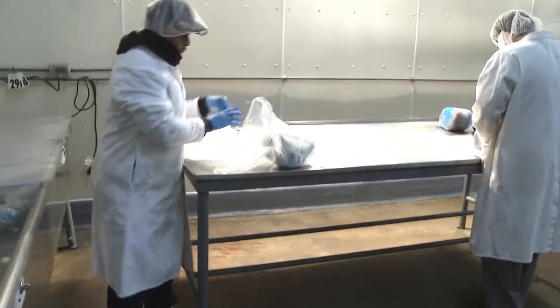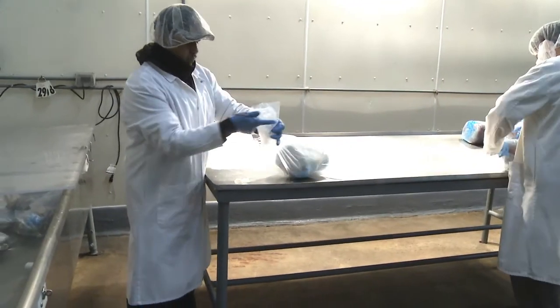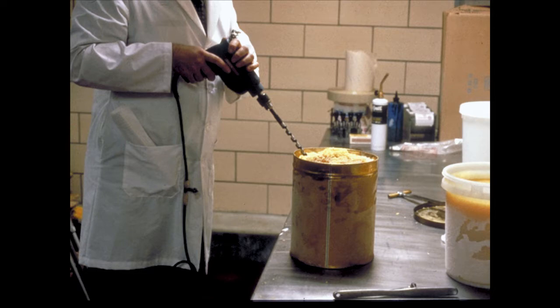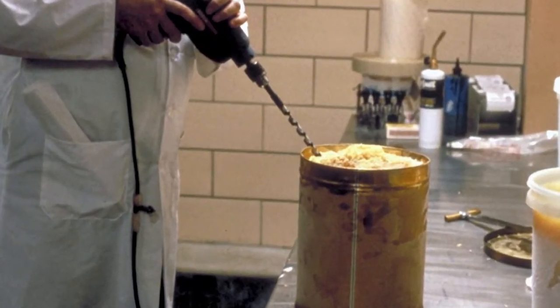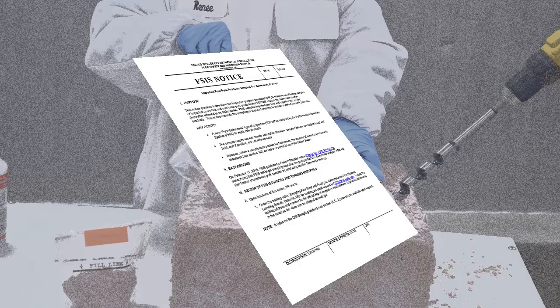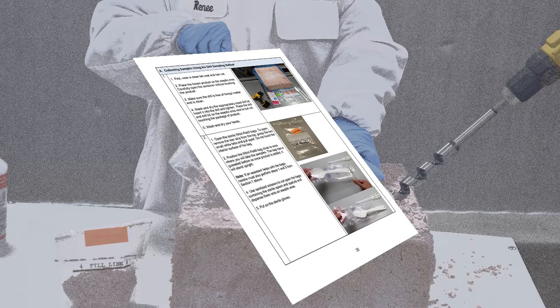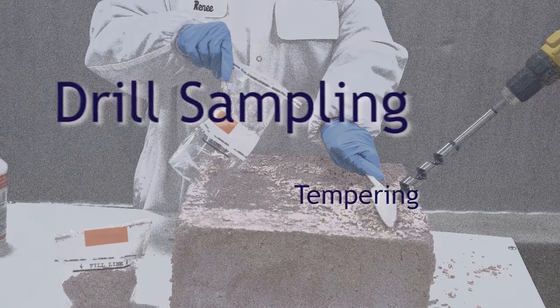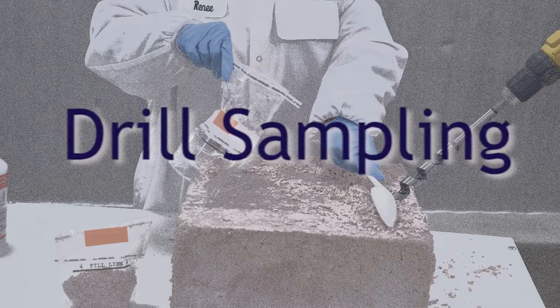Traditionally, FSIS Inspection Program Personnel (IPP) often use tempering to collect product samples. However, the drill and drill bit are typically used in frozen egg products to sample the product for microbiological analysis. The drill sampling method can now be used for frozen, non-intact meat and poultry products to sample for microbiological or even residue analysis. This video will explain how this sampling method is accomplished and show why the drilling method may be preferable to product tempering for certain meat and poultry products.